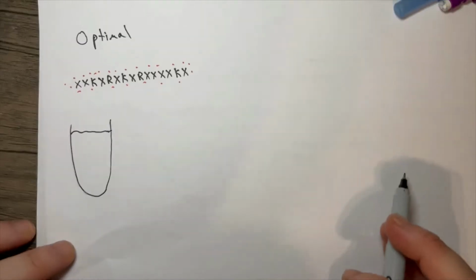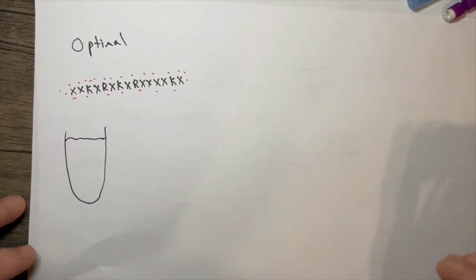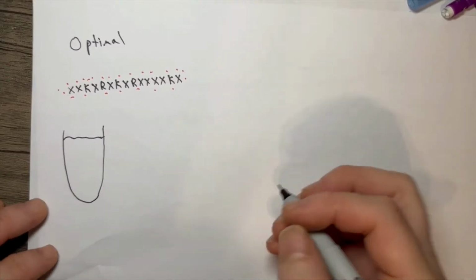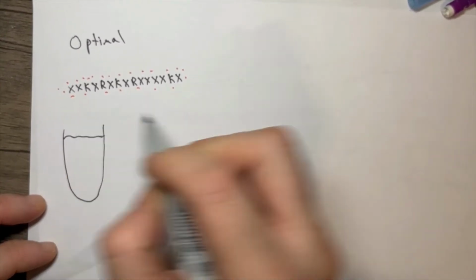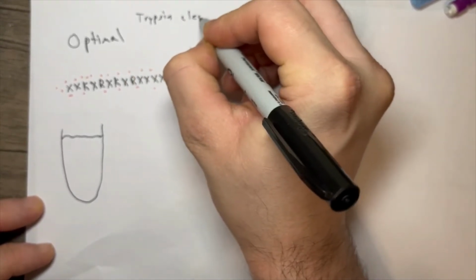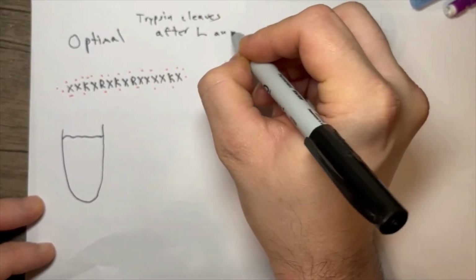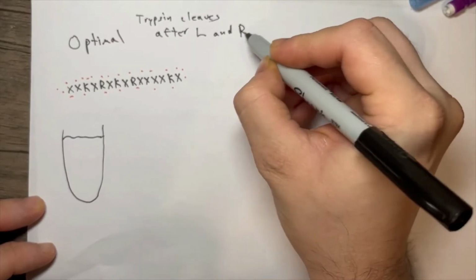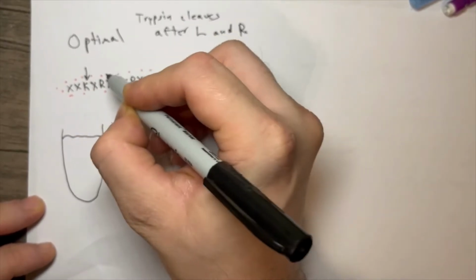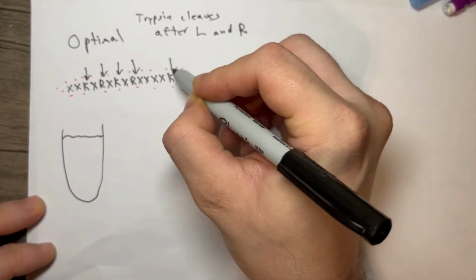All over it, that are like an orange dye color. So they'll basically turn the supernatant orange. But more importantly, we said that trypsin cleaves after lysines and arginines. So it'll cleave 1, 2, 3, 4, 5.